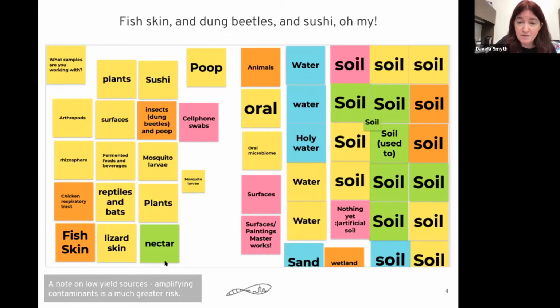But please, folks, if you are downloading things, make sure that you don't delete it for everybody else. This is our Jamboard, and we wanted to emphasize that a lot of folks are working on the same sample types. In your session folder, you will see a resources document, and we're going to add any resources that are particular to sample types. For example, if you're asking about soil extraction, we'll put in kits that we know you can use for soil and everything else.